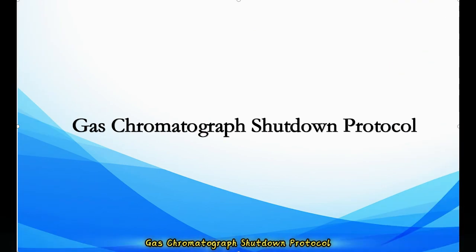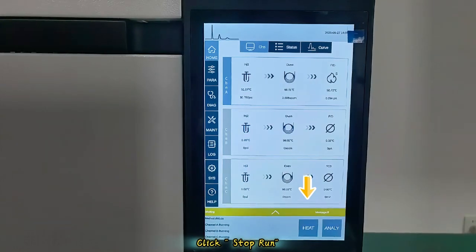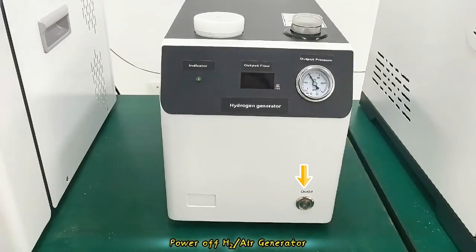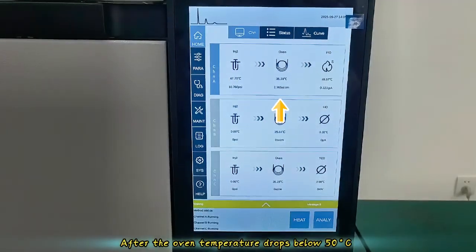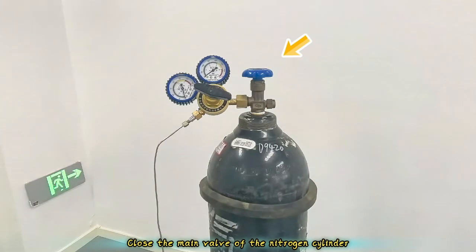Gas Chromatograph Shutdown Protocol. After sample analysis completes, click Stop, Run. Power off the H2 air generator. After the oven temperature drops below 50 degrees Celsius, power off the GC instrument. Close the main valve of the nitrogen.